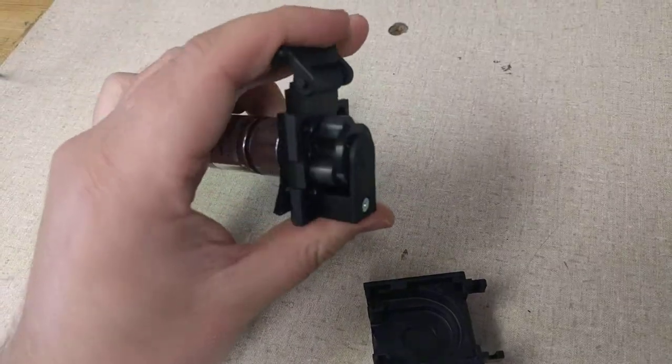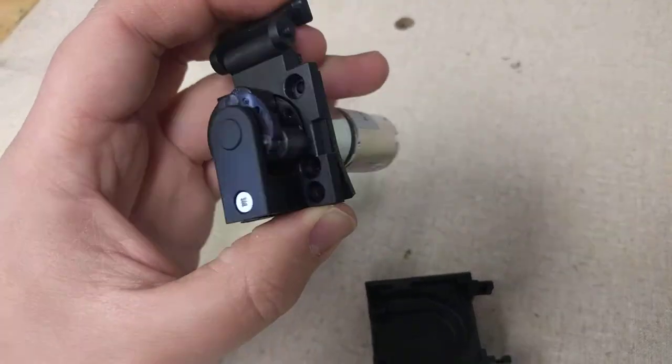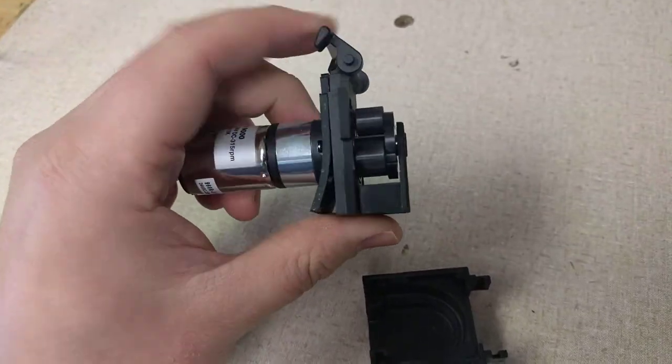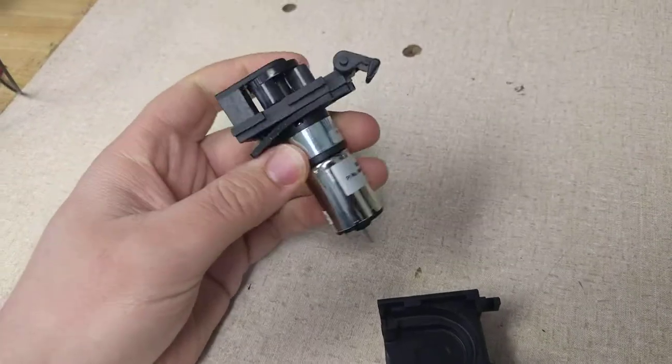There are a different number of roller options available in accordance with different flow rates and different rates of pulsation. You can see the small DC gear motor and gearbox on the back.